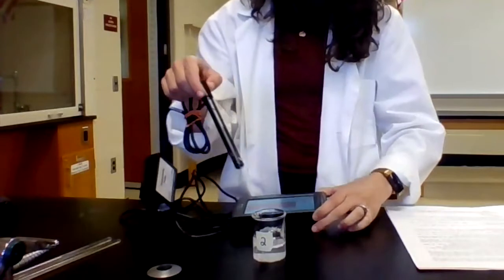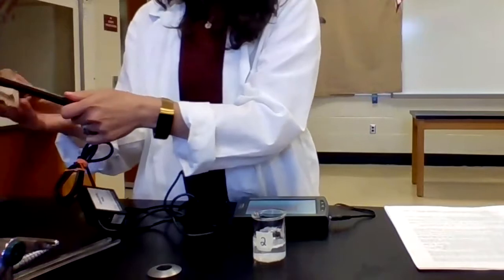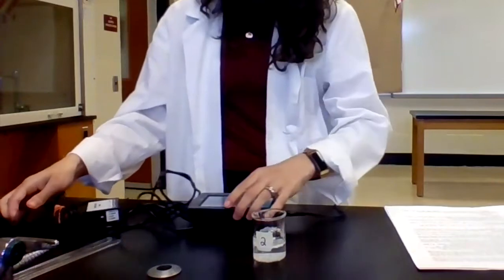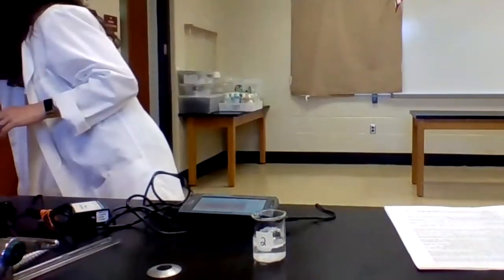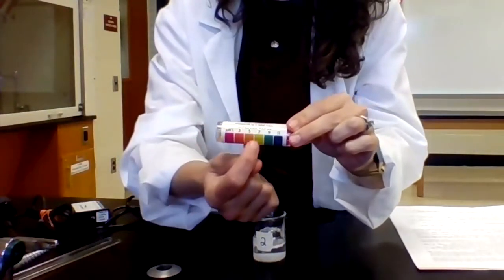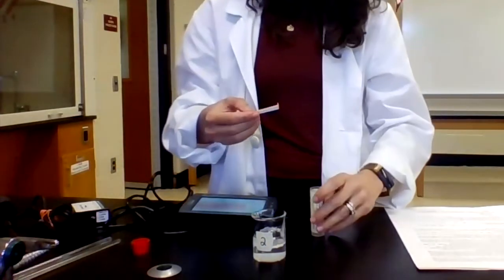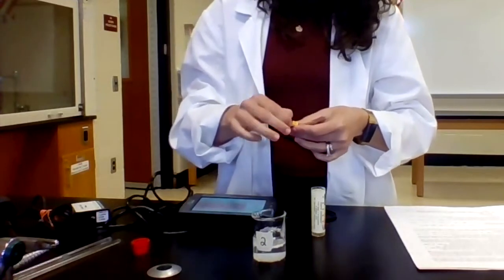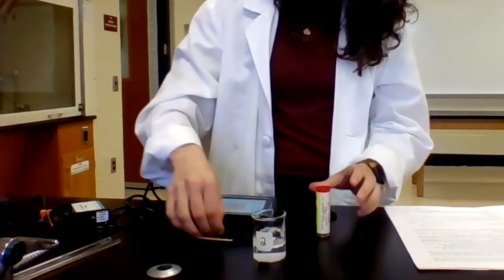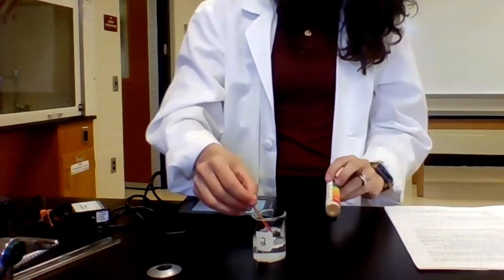Now, one way that I can try to confirm if my polar covalent compound is acidic, not all polar covalent compounds would be, but one way I can determine that is by simply using some litmus paper, some pH paper. It'll change color depending on the pH. So I'm going to dip this in here.